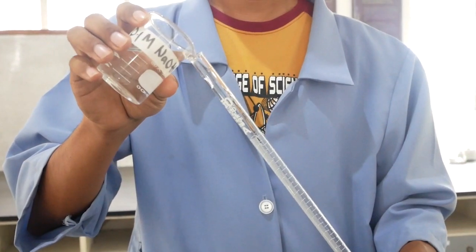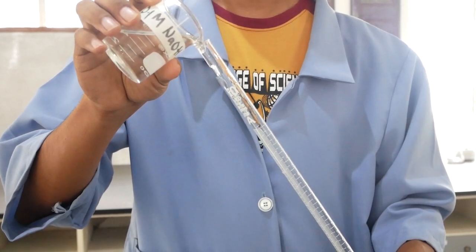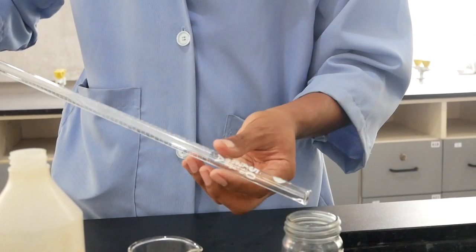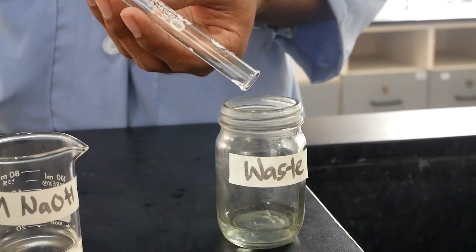For the final rinsing, use a little of your sodium hydroxide titrant to rinse off any remaining water inside the burette. Pour this into a waste jar as shown here.